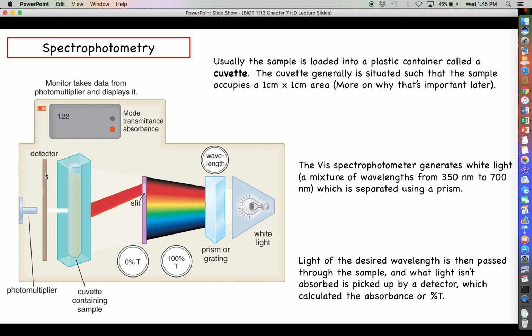So if we put all of this together and we look at this formula here, which is A, the absorbance, equals the molar extinction coefficient sigma times the concentration, which is what we're looking for here, and then times L, the path length, which we know is always 1 centimeter.